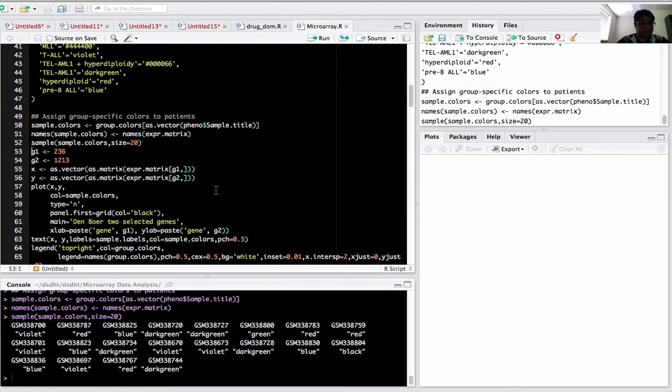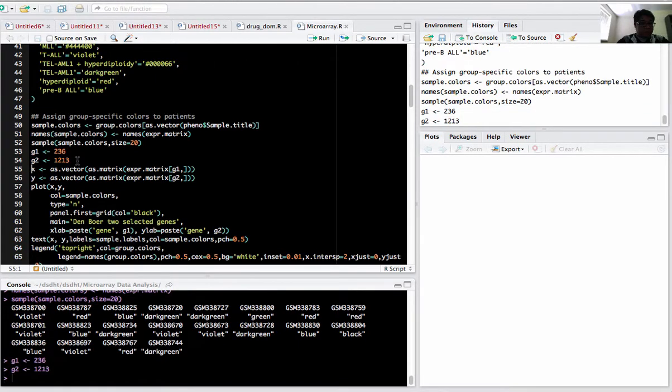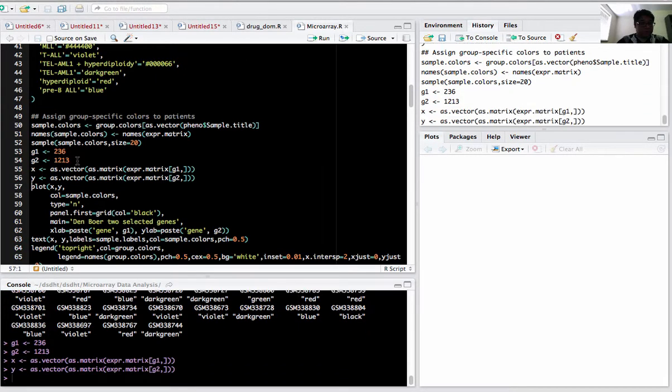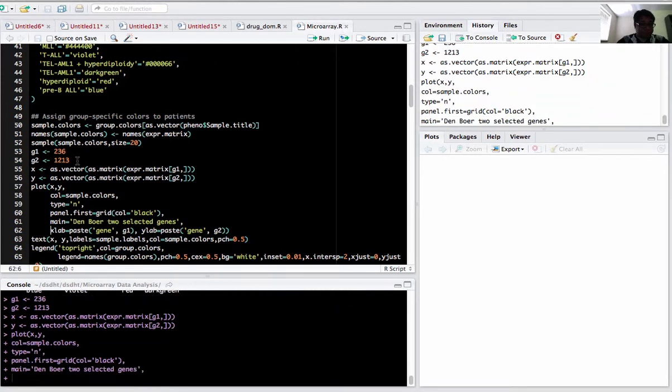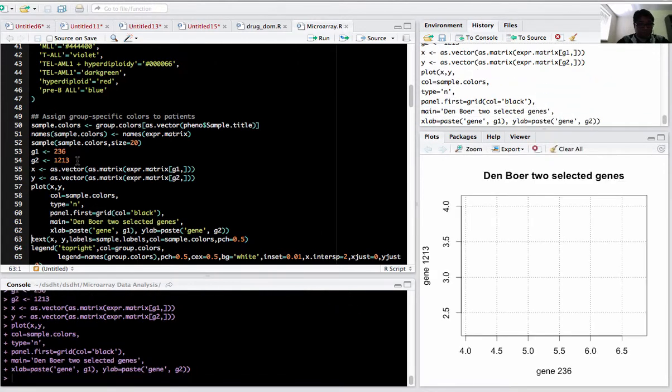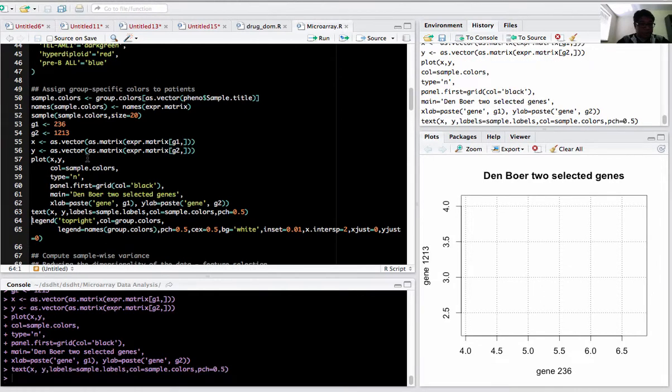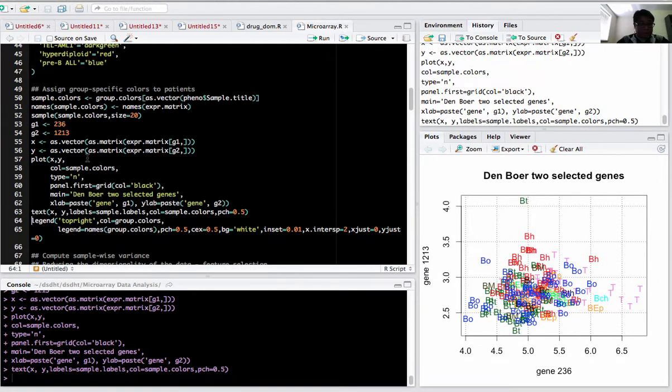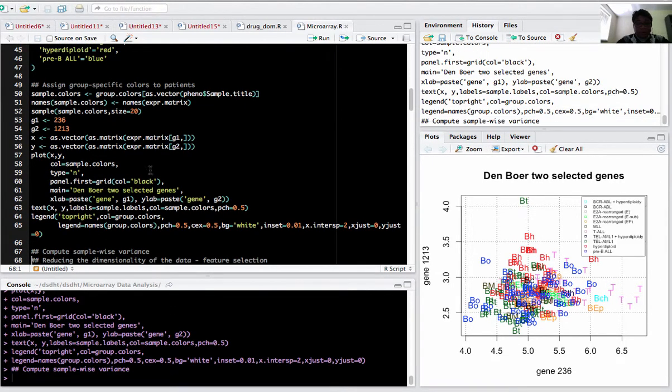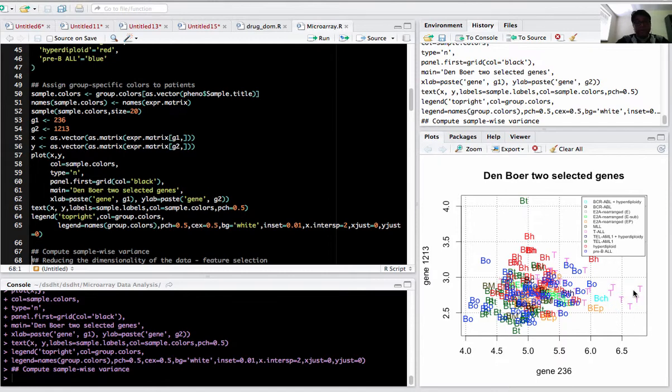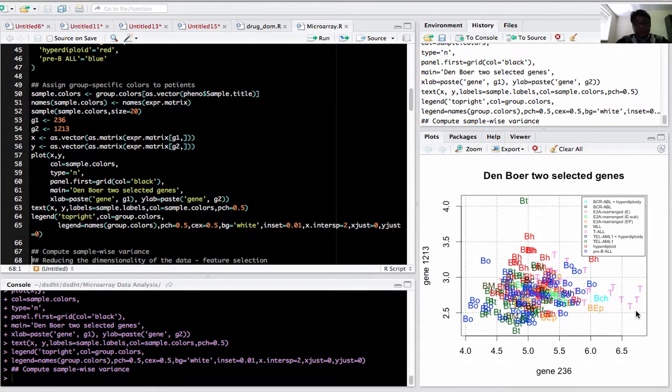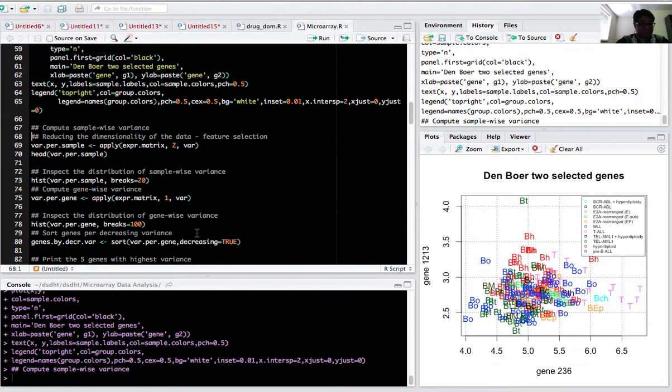I selected random genes, for example 236 and 1213. I selected the gene numbers, the 236 row and 1213 row, and plotted the data. Both genes can be separated based on the T-cell type. There's high variance, high expression on gene 236 and very low expression on 1213. So the T-cell type can be easily distinguished based on the high expression level of gene 236.